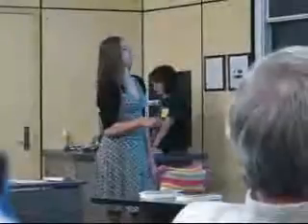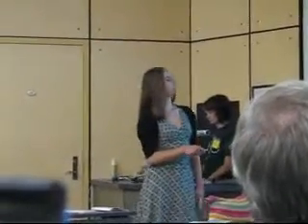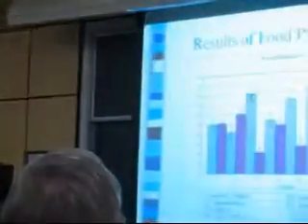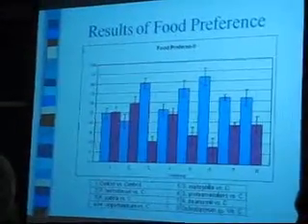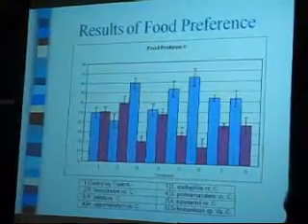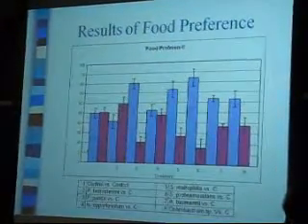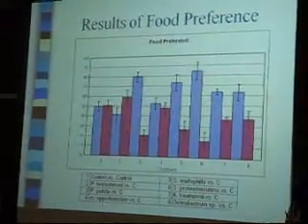And these are results. The dark purple is the control, so the E. coli on each plate. These are the different treatments right here. And as you can see, this number 1, that's our control plate with E. coli on both sides of the plate. And you can see that it's pretty much 50-50, which is what we wanted to see.